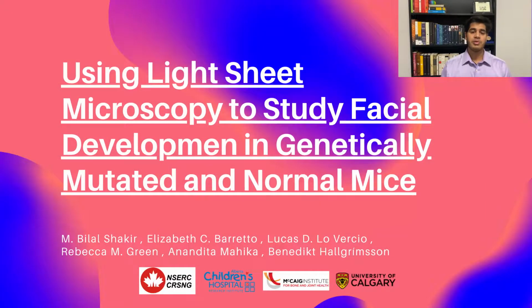Hello, my name is Bilal, and today I'm going to be discussing how I've been using novel light sheet microscopy to study the facial development of genetically normal and genetically mutated mice.